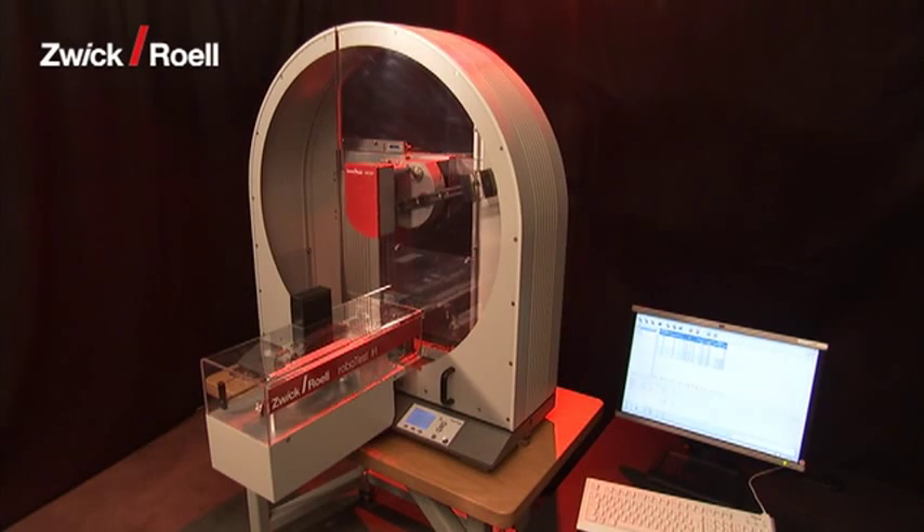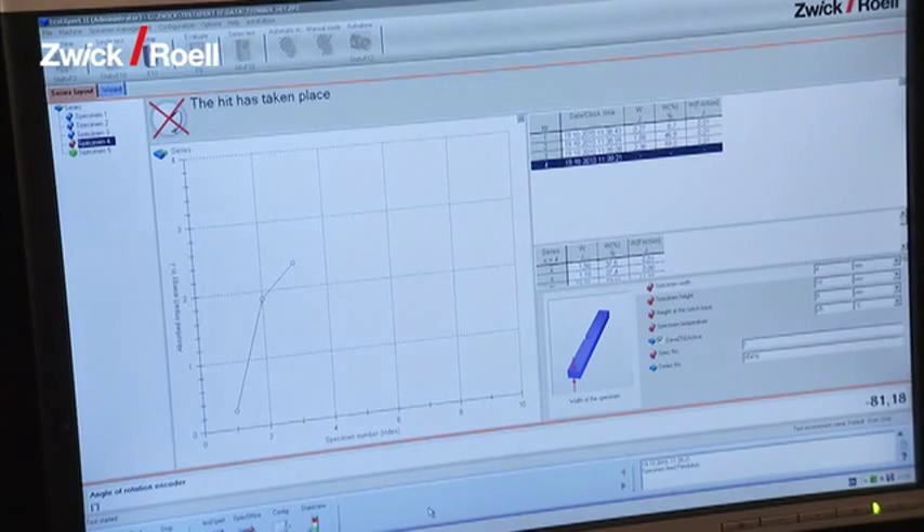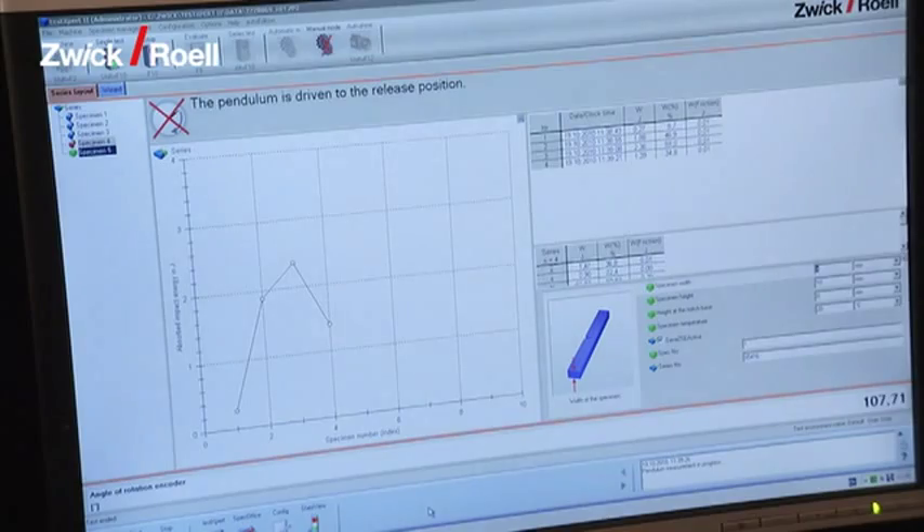The individual specimens are automatically tested one after the other. The test results can now be read off directly from the screen in the TestExpert testing software.